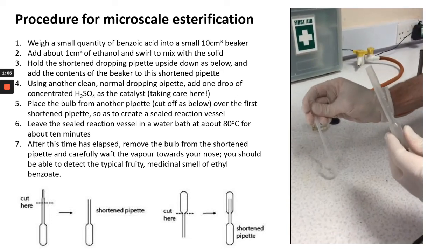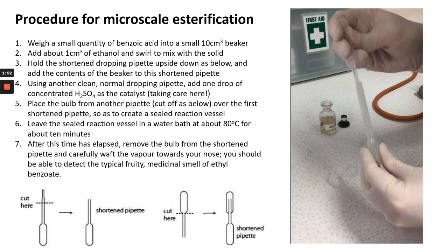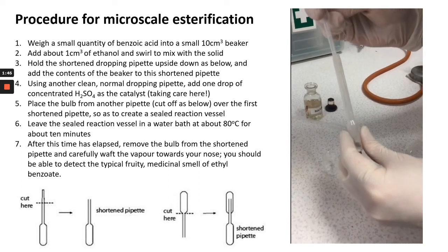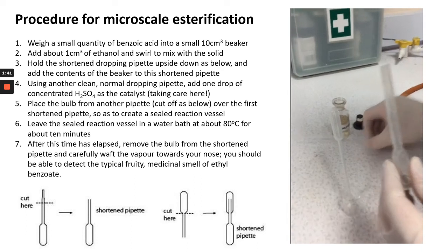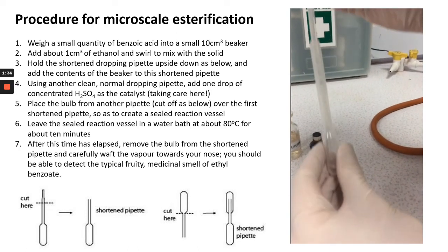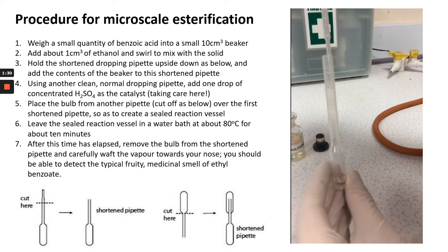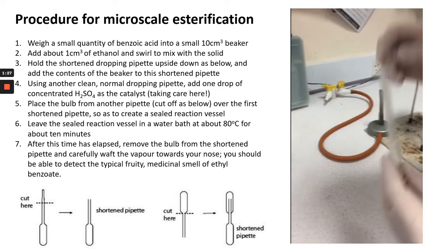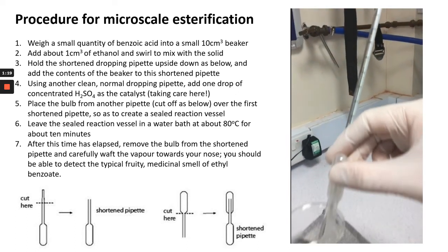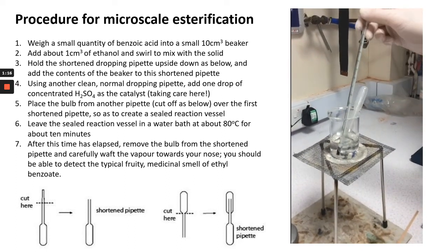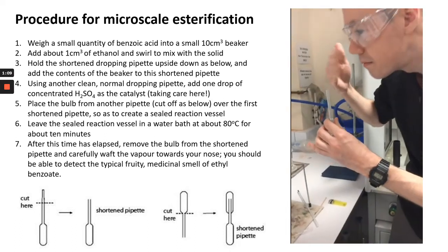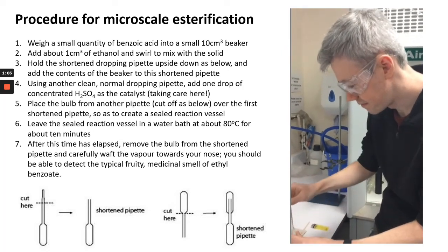Putting the reaction mixture carefully into one of the cut pipettes — the one with the neck remaining — that's going to form the main reaction vessel. In the background is a stock bottle of concentrated sulfuric acid; we're going to add one drop of that to act as our catalyst. Because of the risks involved in handling it, doing it at micro-scale makes it safer. We then put the bulb of the other pipette on top to form a semi-sealed reaction container. The water bath has been set up at 70 to 80 degrees C, and it's left for 10 minutes to esterify. Then Ollie carefully wafts the vapour towards his nose to detect the smell of ethyl benzoate.